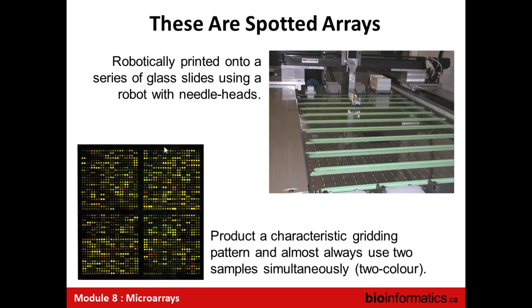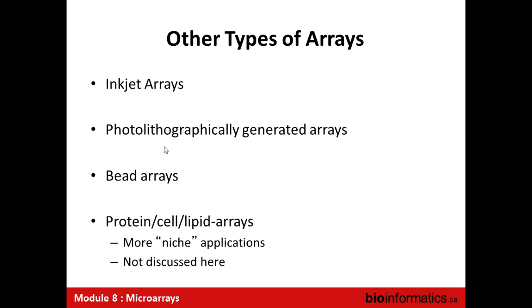So the concentration of DNA increases over time because you have a dry out of the sample in each of those 384 wells, which are kind of small. Those sorts of things are extremely common, and they lead to systematic artifacts across experiments. As a result, and for almost 10 years, there was an influx of work to develop new technologies for microarrays. We'll talk about a couple of these.